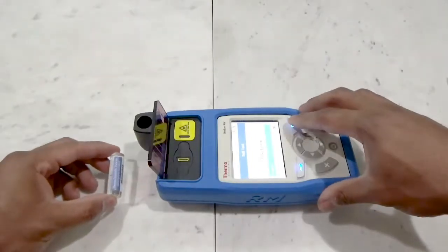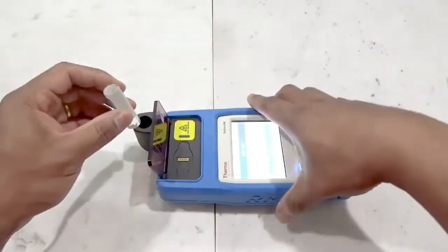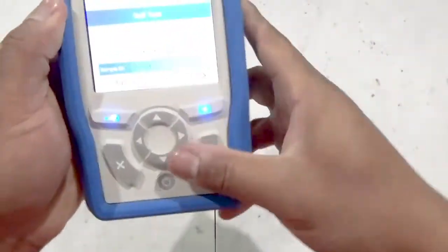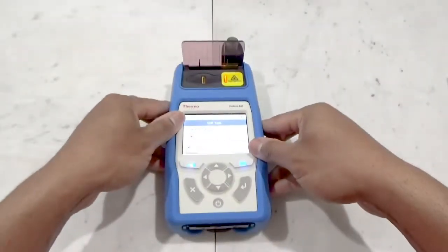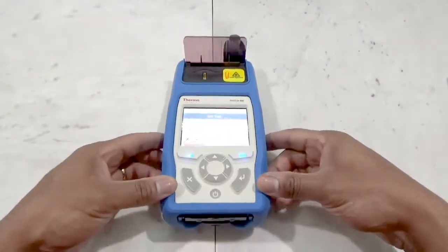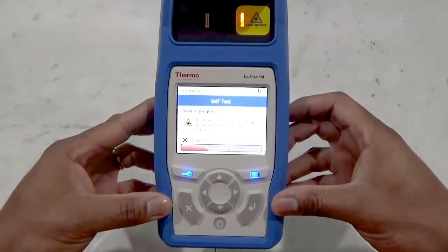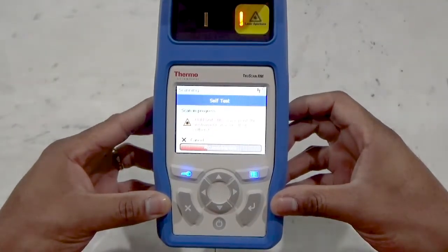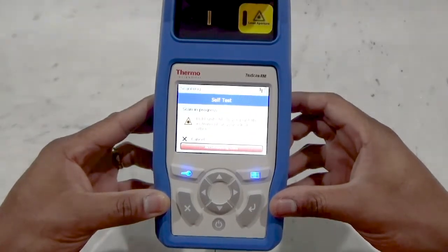One may use the barcode reader to enter in the standard's identifier. Once the sample ID is entered, the standard is placed in the vial holder, attached to the analyzer, and the test is started. During spectral acquisition, while the laser is active, you will note the laser aperture warning light located below the built-in safety shield is illuminated. Once the self-test has completed with a pass result, one may begin to acquire sample run data.